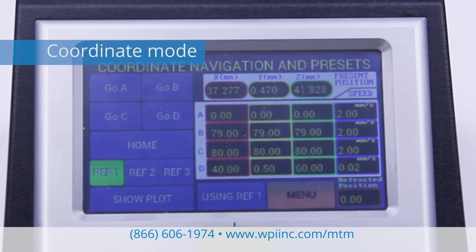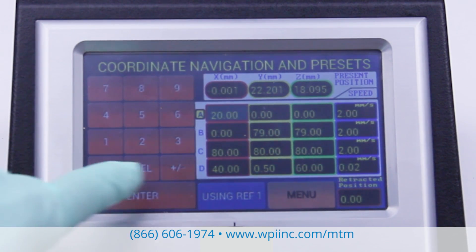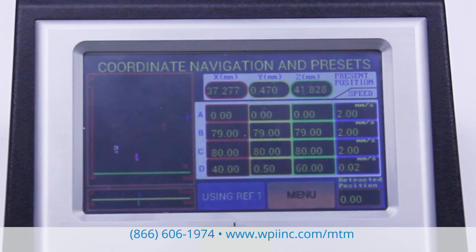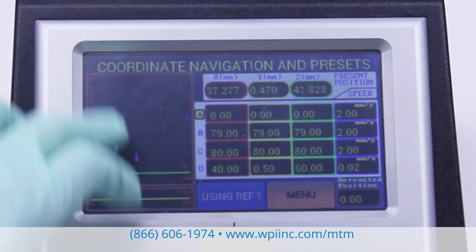The MTM3 coordinate navigation lets you control the movement of the axes by specifying a set of three-dimensional coordinates with a resolution of one one-hundredth of a millimeter. Each axis has a 79-millimeter range of movement. With coordinate mode, you can store up to three reference points.